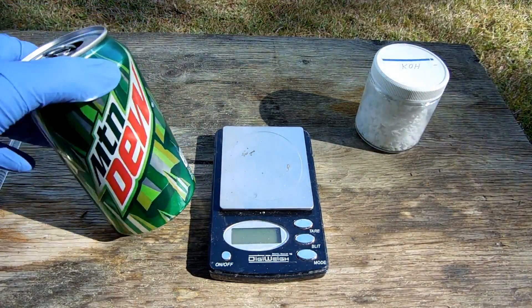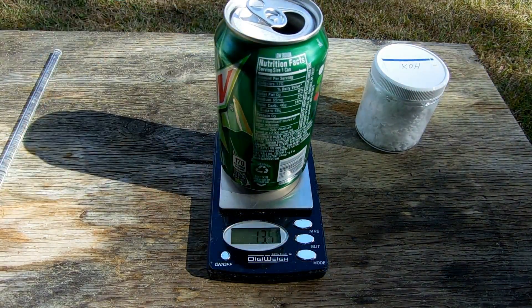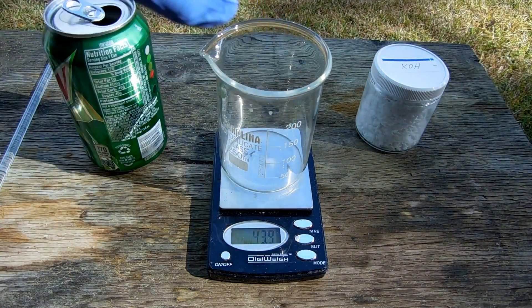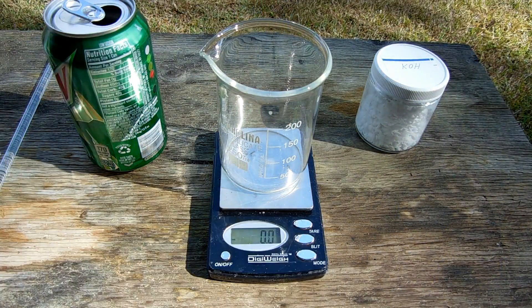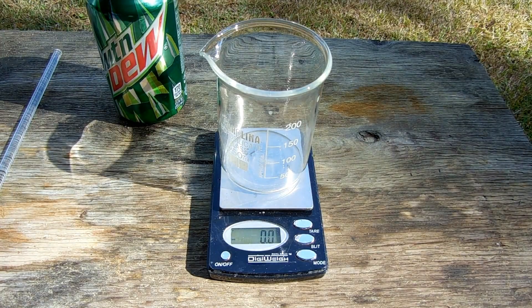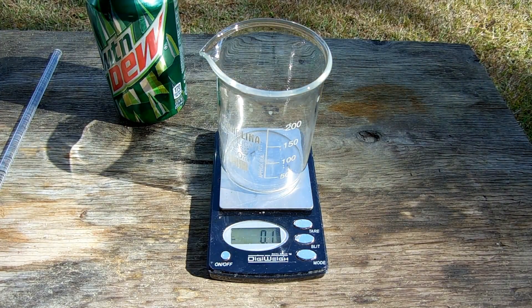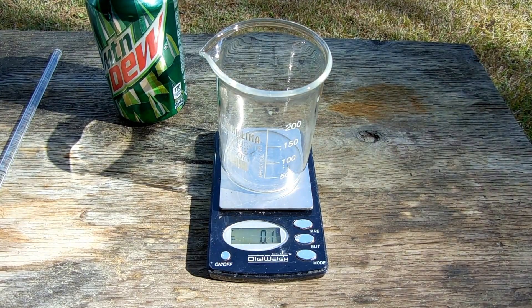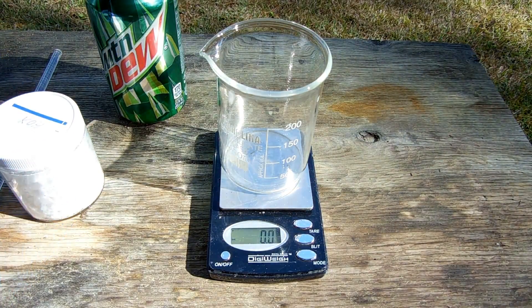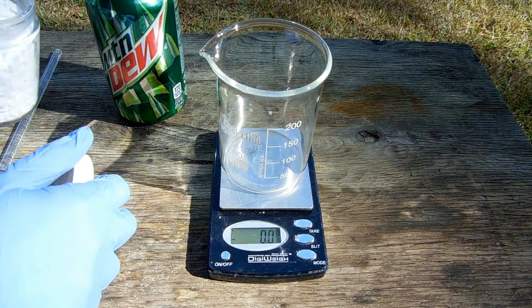I drink a lot of soda, particularly Mountain Dew, so I end up with a lot of spare cans. This can weighs 13.5 grams. The first step is to react it with potassium hydroxide to make potassium aluminate. The can is not entirely aluminum — bits and pieces are actually an alloy, then there's the label, and a layer of plastic on the inside to protect the aluminum from the acidity of the drink. Potassium hydroxide is also always composed of 10-15% water, so we have to account for that. Stoichiometry tells me I need 28 grams to react with that amount of aluminum, but we're going to bump it up to about 30 to account for those two things.